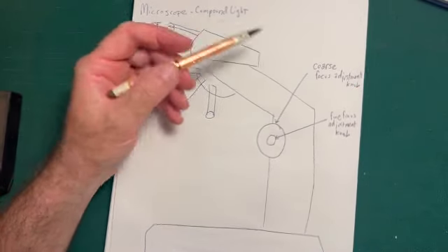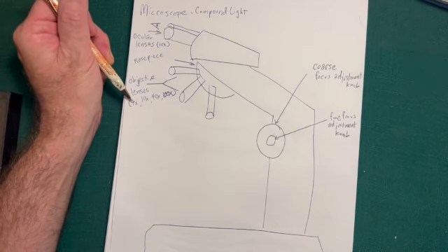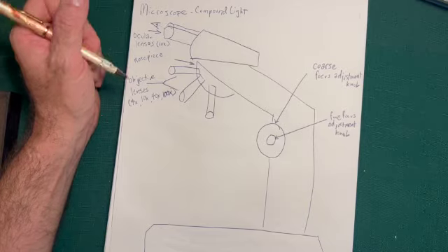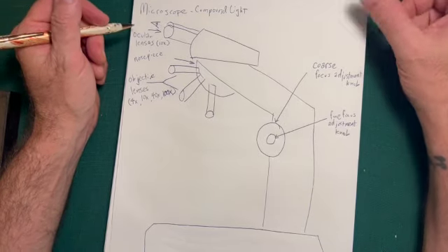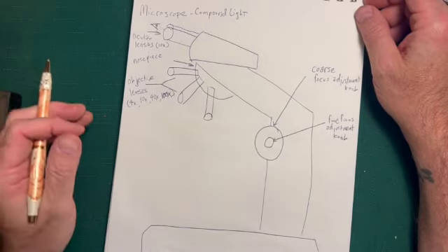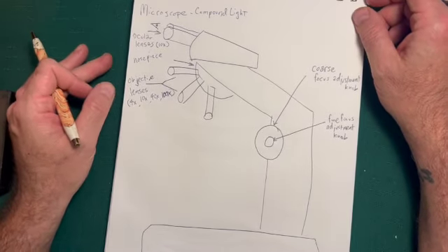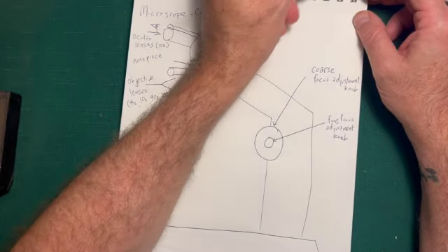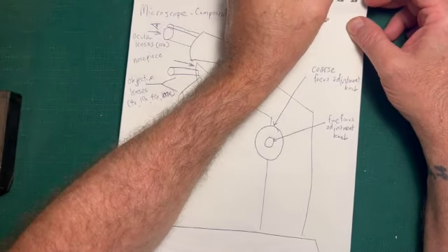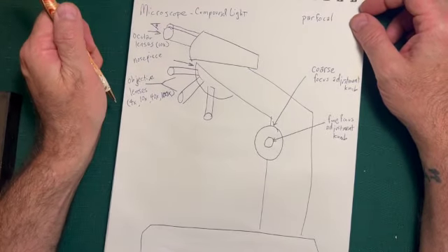So usually we use the coarse focus adjustment knob on the lower power, so 4x, 10x. And then if our microscope is a good microscope that has been calibrated correctly using lenses that have all been specifically manufactured for whatever model of microscope we're using, then the lenses will be parfocal, meaning the focal length will stay the same no matter which objective lens we're using.